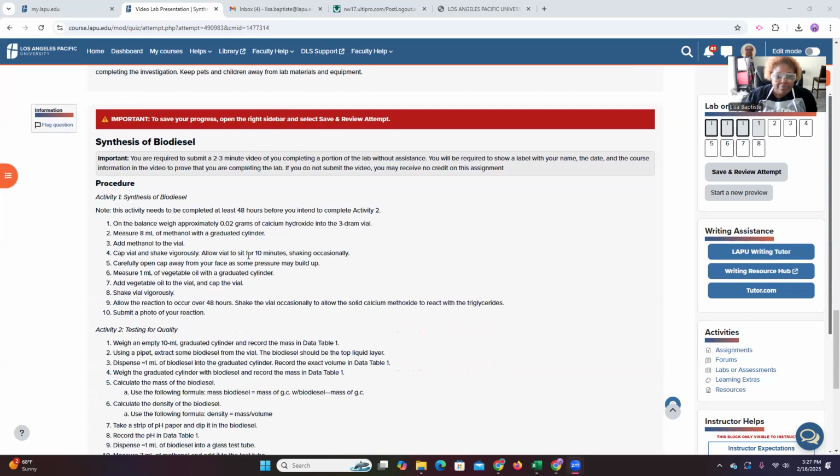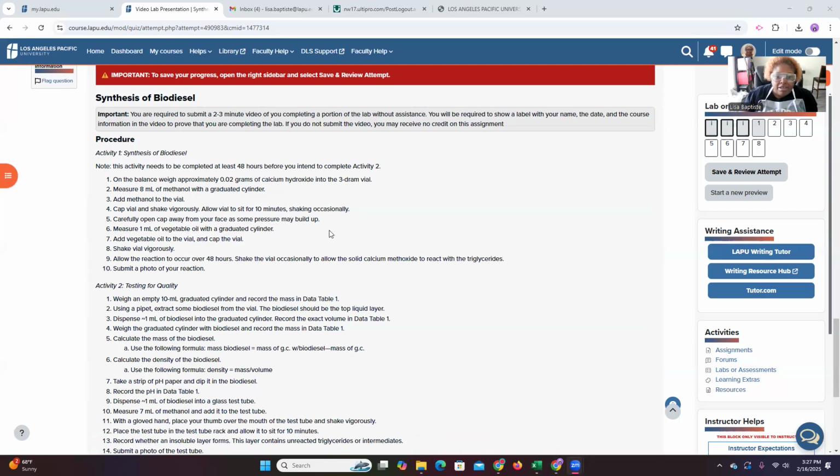All right, so now that I've gone through the safety, if you have any questions about the safety or about this experiment before you get started, please let me know, okay? And so I want to stress here, before I go over the procedure, that you want to allow the reaction to occur over 48 hours.